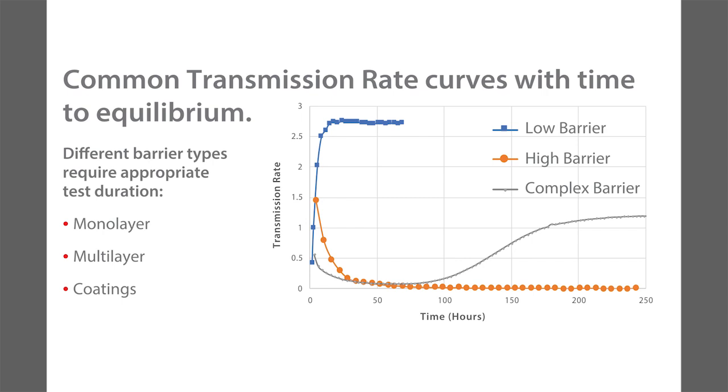And given time, they're going to come up and reach an equilibrium level. Like an EVOH might act like this, especially challenged with 100% oxygen versus room air. But this happens in real life with complex barriers. And that's one of the things I talked about.